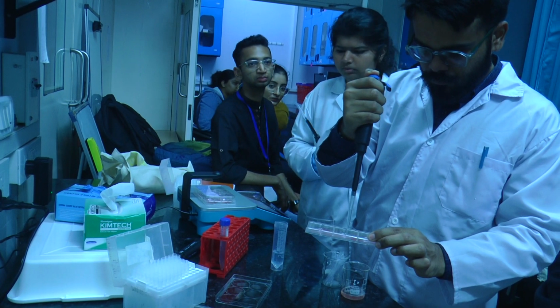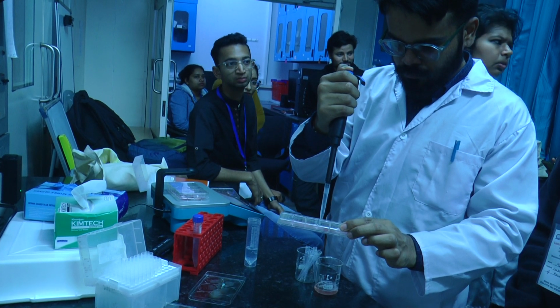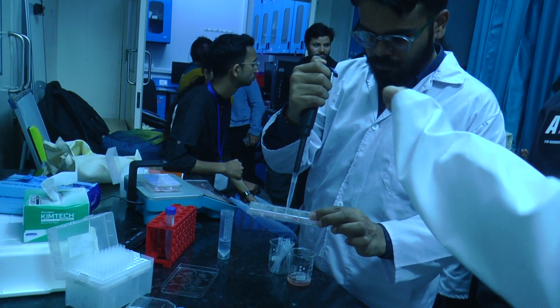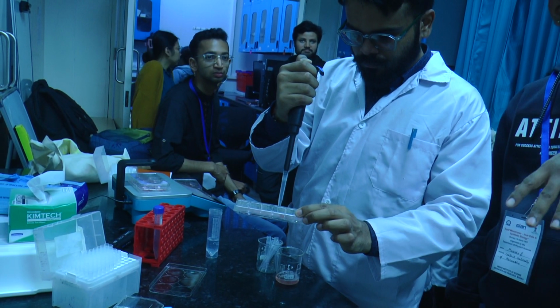Okay. One. There is a reading there. We fix it. So I have set it at 1 ml. Do you have a biosafety hood inside? Yeah, it's this side.